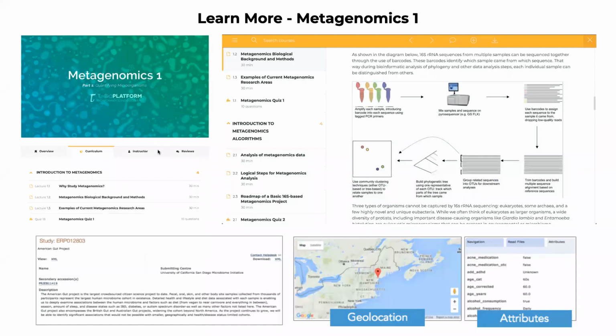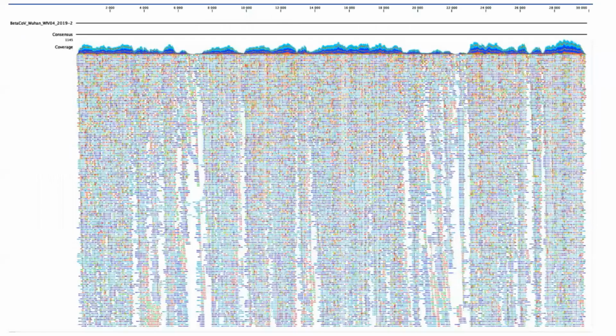And there's a project in Metagenomics 1 that illustrates that process of targeted or amplicon sequencing and how to use it to understand what happens with microbiome changes in humans. So then we also talked about the process of next generation sequencing itself, how the digital data is produced, and what these individual reads are.